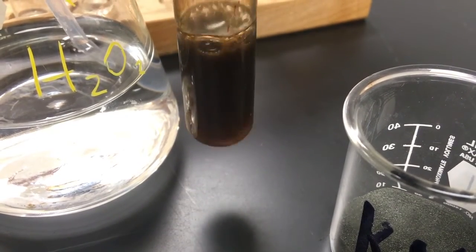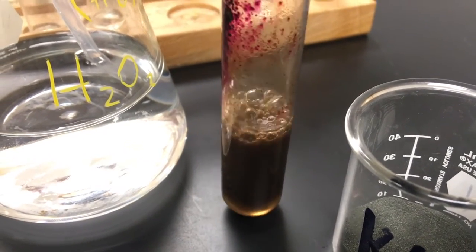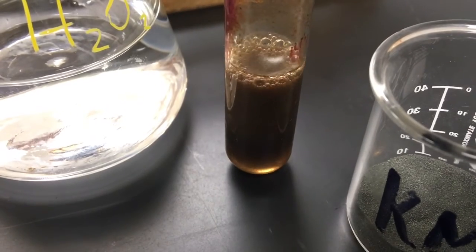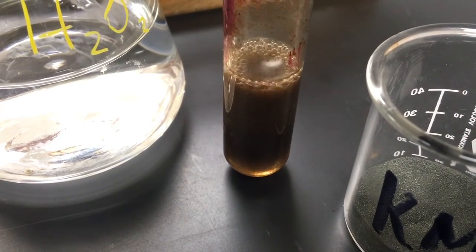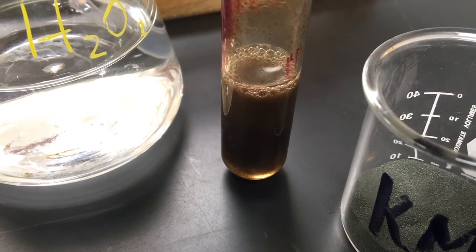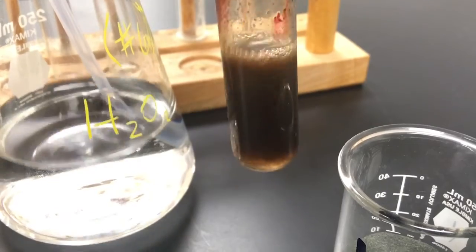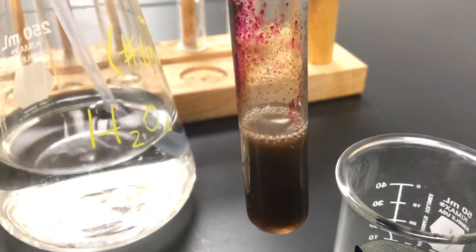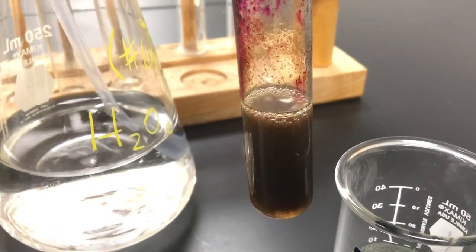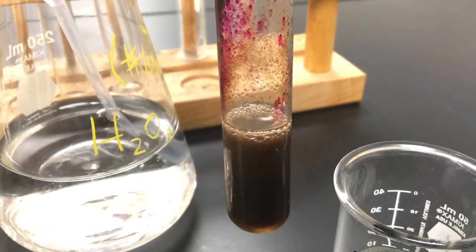In fact, if we can finish reacting all that hydrogen peroxide away, you can kind of already see a little bit of that at the bottom. That KMnO4 powder is basically just settling at the bottom after that hydrogen peroxide has finished reacting. I'll come back and show you a picture of what this looks like when it's really done.